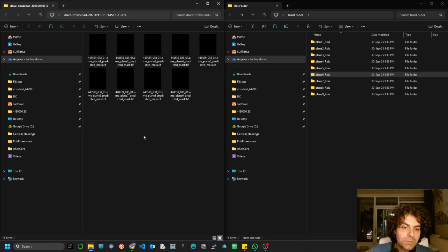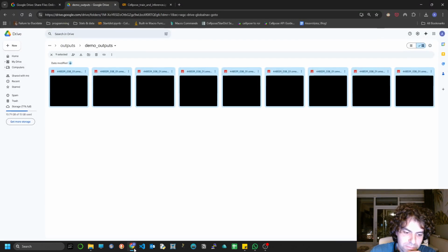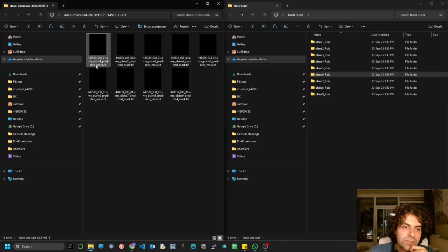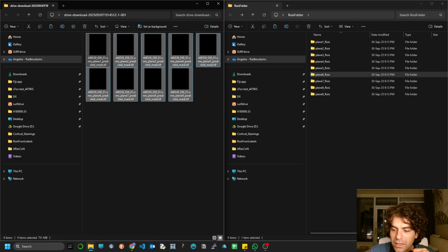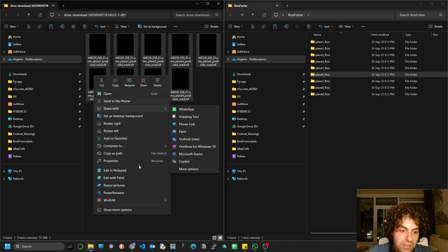Another thing that I notice here is that based on the code that I have, there's a conversion to mask at the end, and we want to change that, and we can change that now. I'm using a tool which makes my life a bit easier when I want to make conversions of names. You will need that anyway for some part of the AResCoN, so I recommend it. It's the Power Toys. Let's see. It's the Power Rename, so it's actually from the Power Toys.